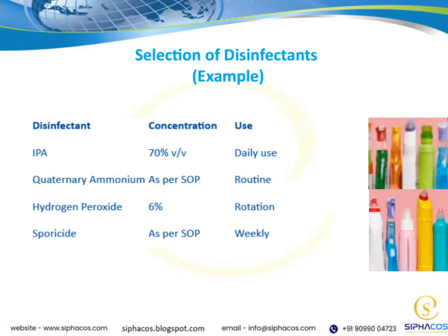Let's take a closer look at the selection of disinfectants. When choosing the right disinfectant, it's important to consider its effectiveness against specific pathogens, as well as the surface or material you're treating. Different disinfectants work better for different situations, so understanding their properties is key.